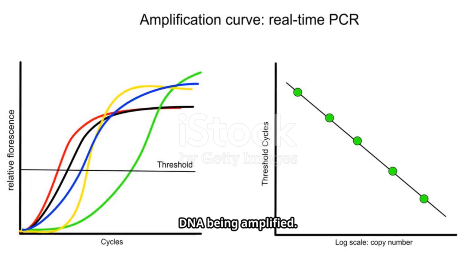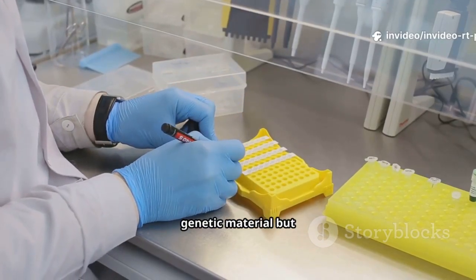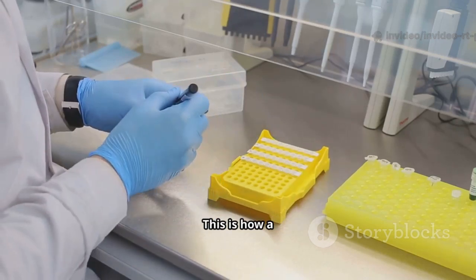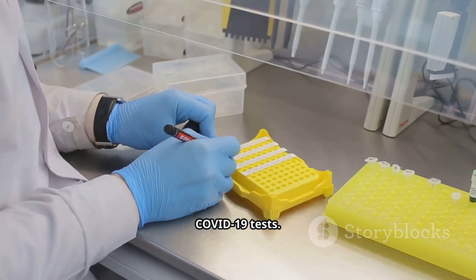amplified. Quantitative results. This allows scientists to not only confirm the presence of a genetic material but also measure how much of it was originally in the sample. This is how a cycle threshold, CT, value is determined in COVID-19 tests.